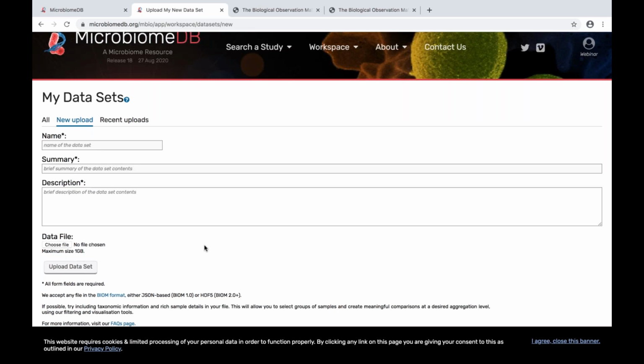So I have prepared a small file that I will upload. I will just fill this in. If you have a lot of these, it's helpful to say what they are.